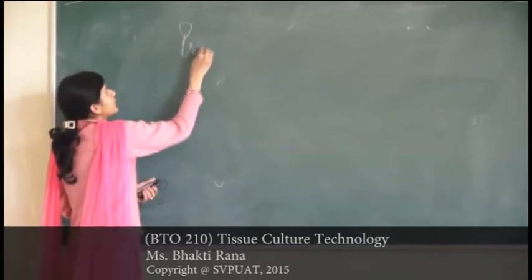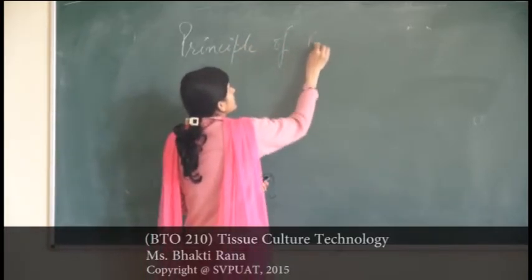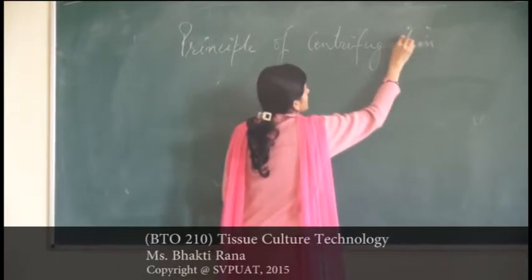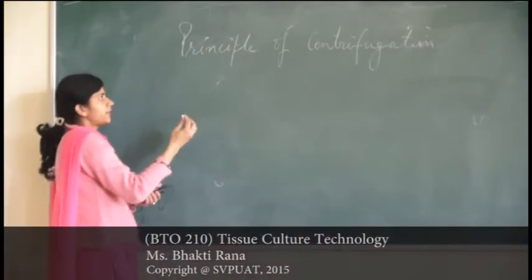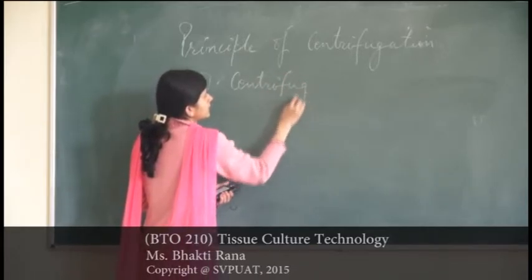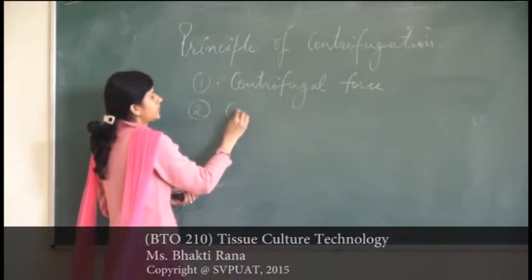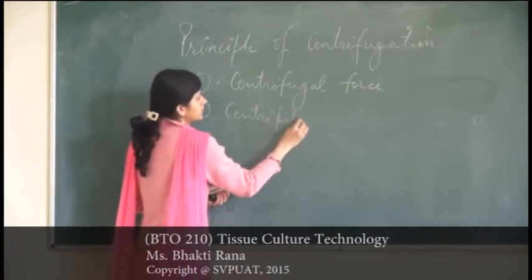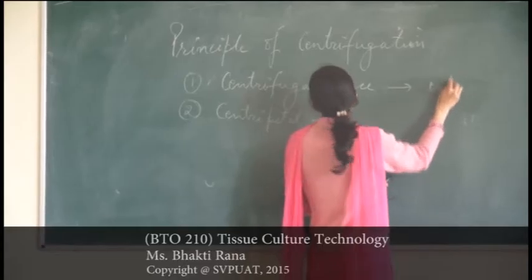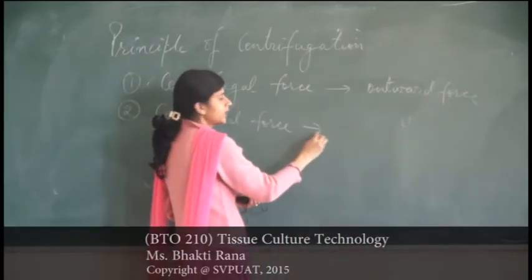Next comes the principle of centrifugation. Two forces are involved. First is centrifugal force and the other one is centripetal force. Centrifugal force is the outward force and centripetal force is the inward force.